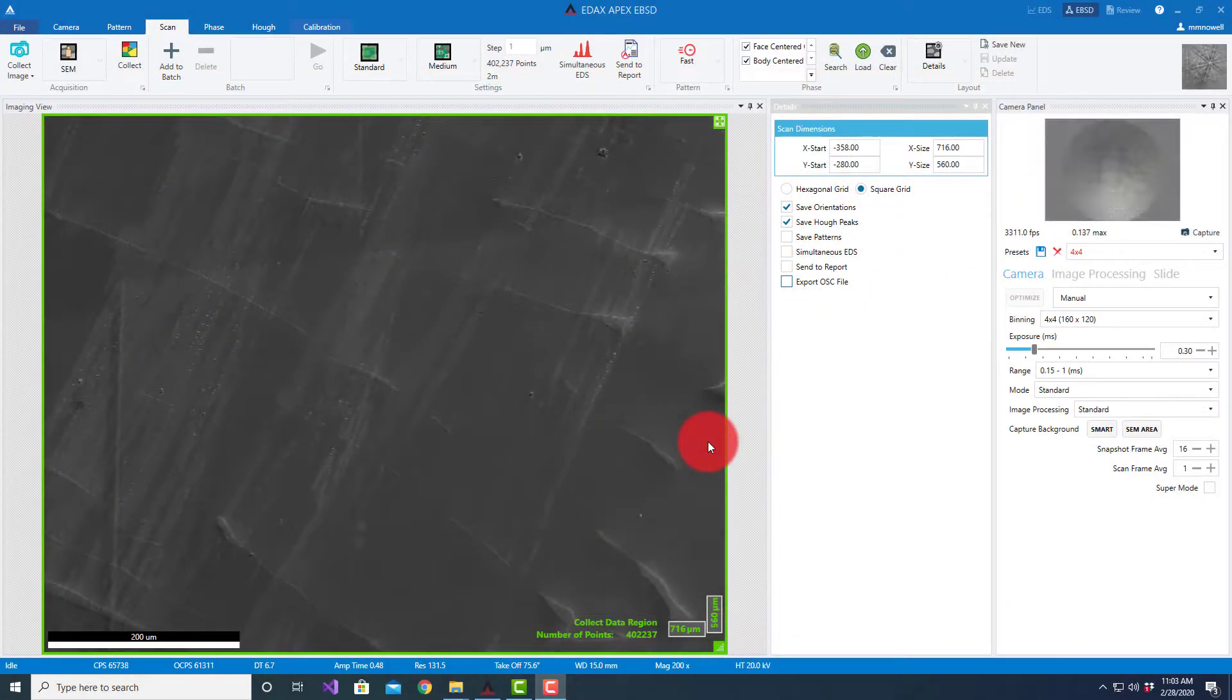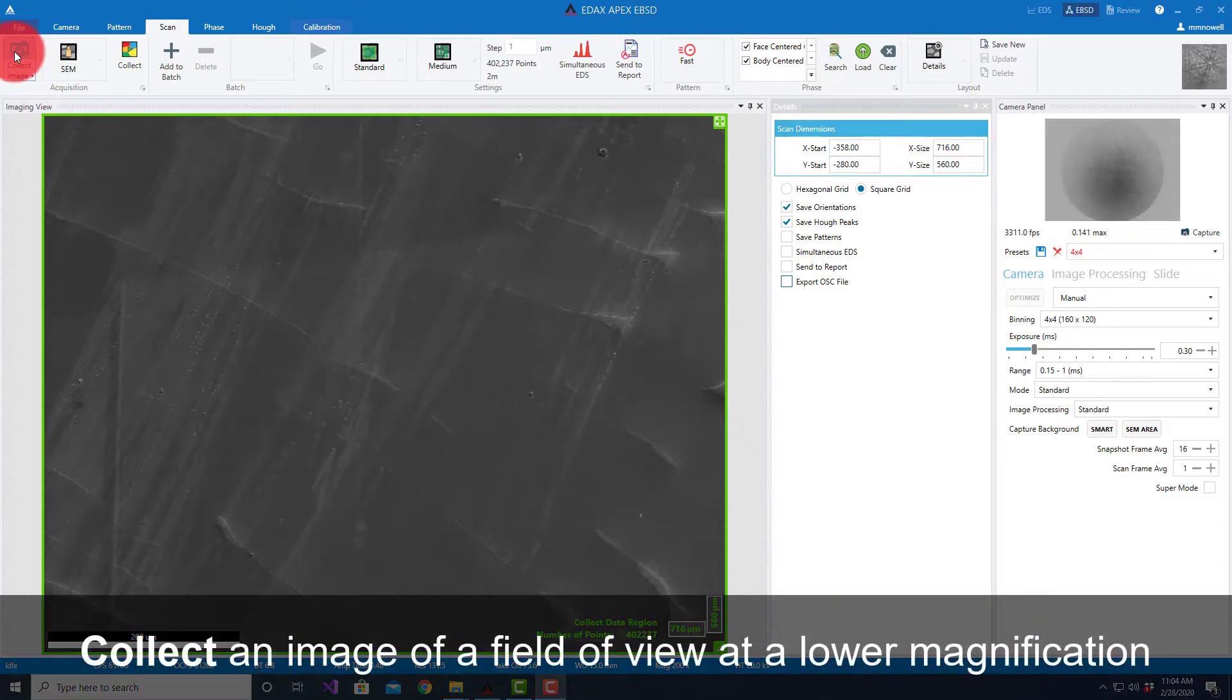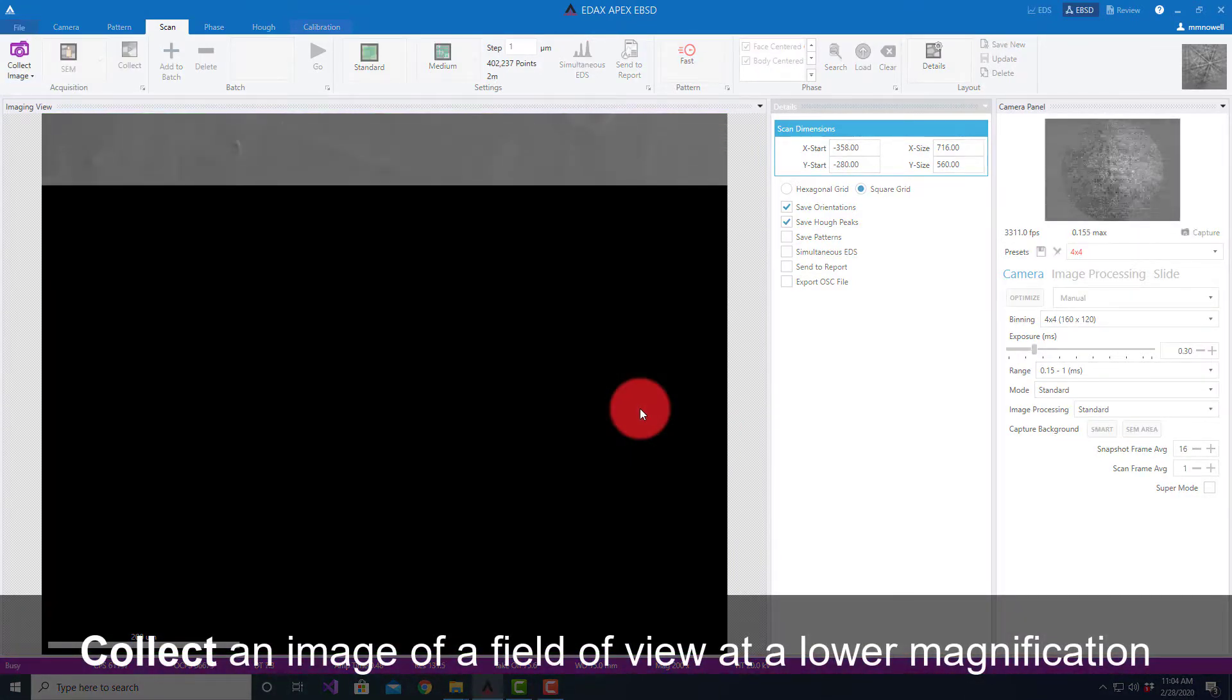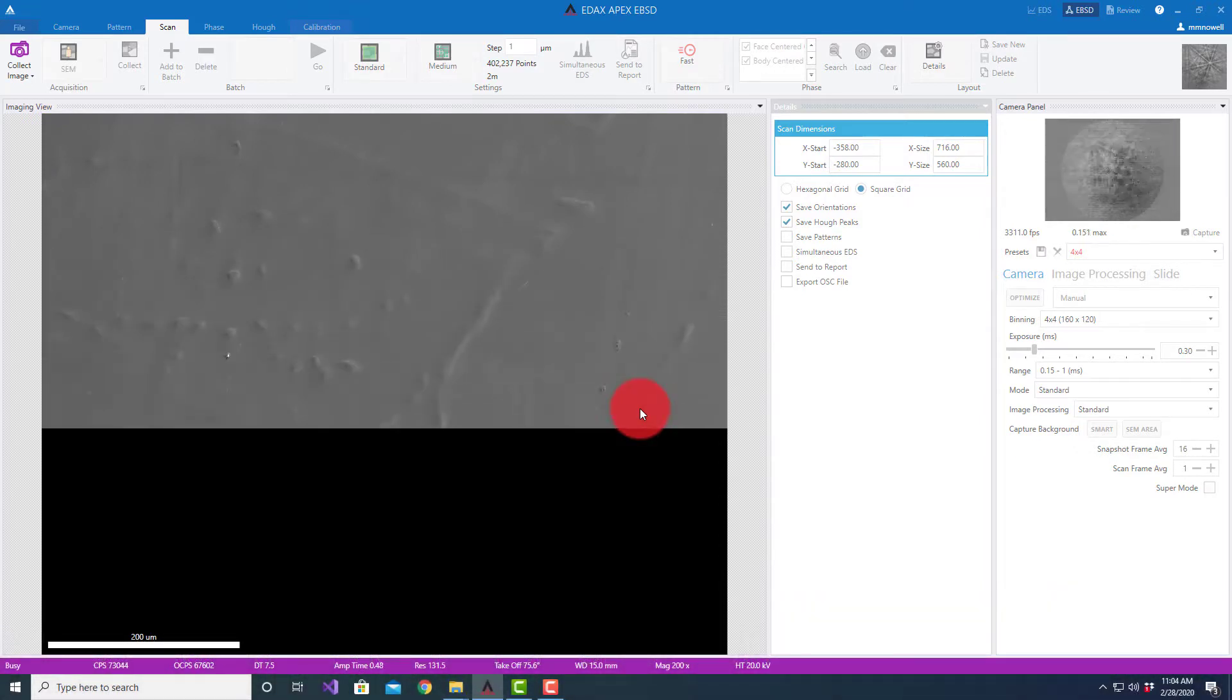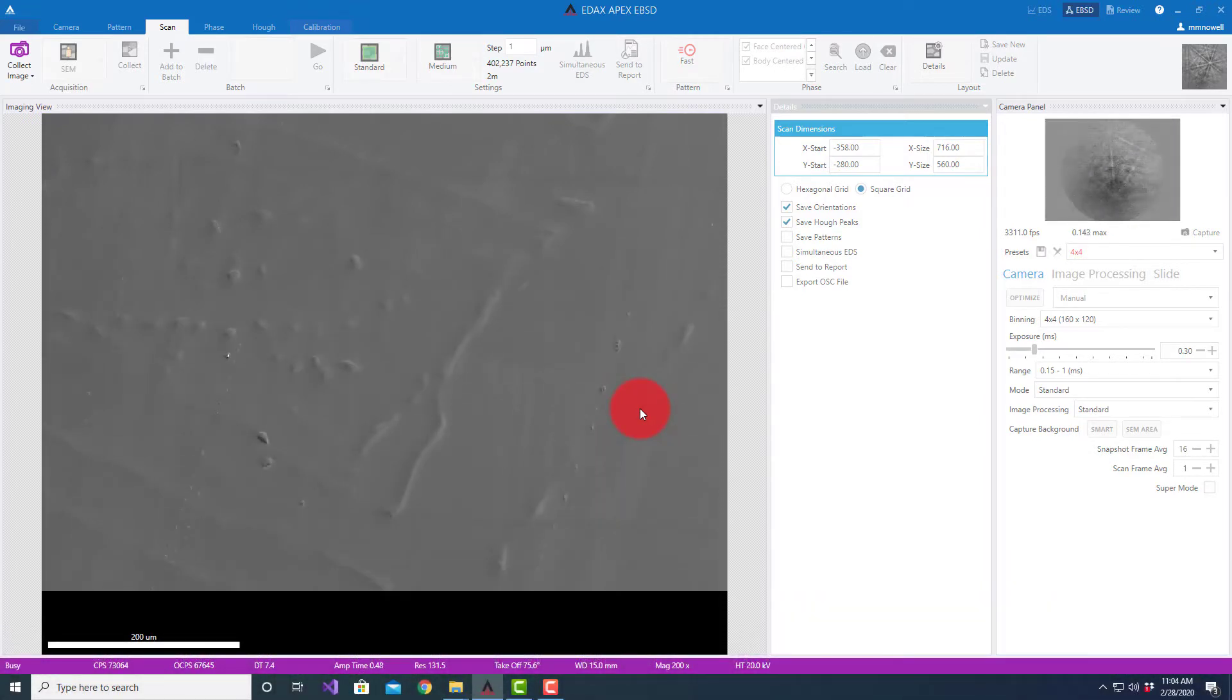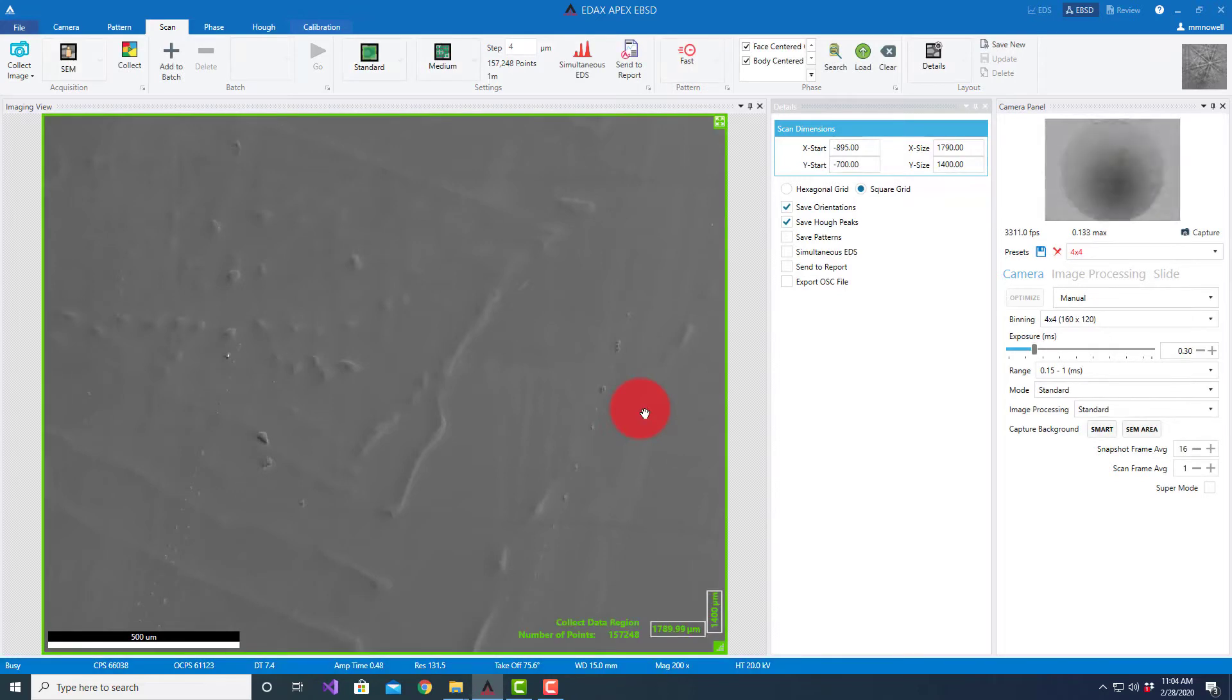This video will introduce the batch scanning capability within APEX EBSD. I'm going to first start by collecting an image of a field of view at a lower magnification. Let's say I want to collect this map.